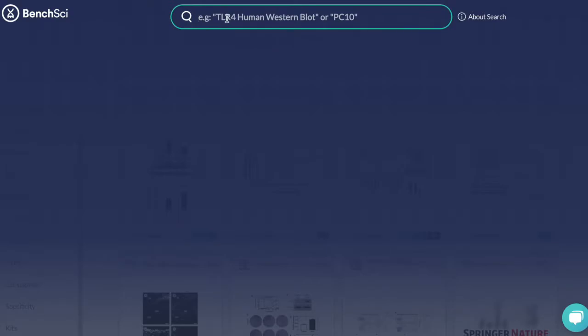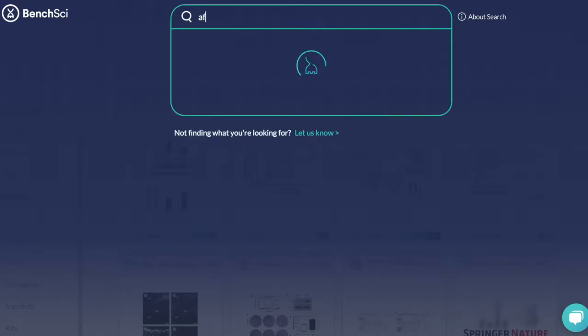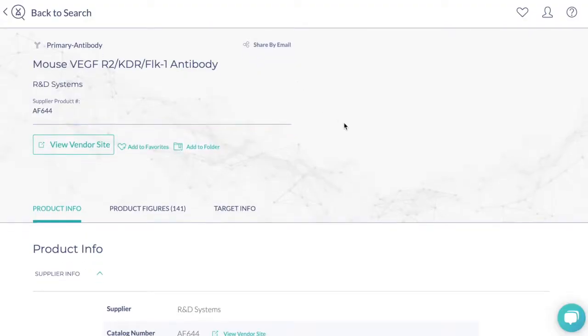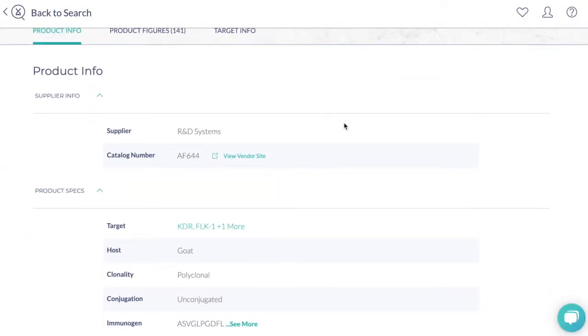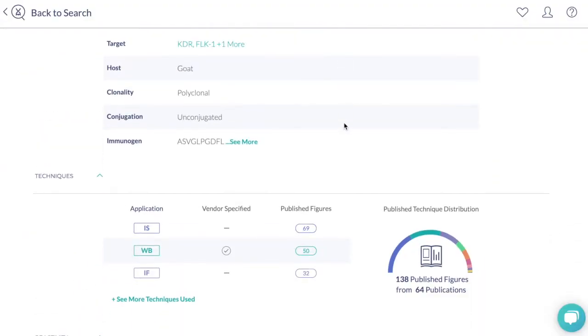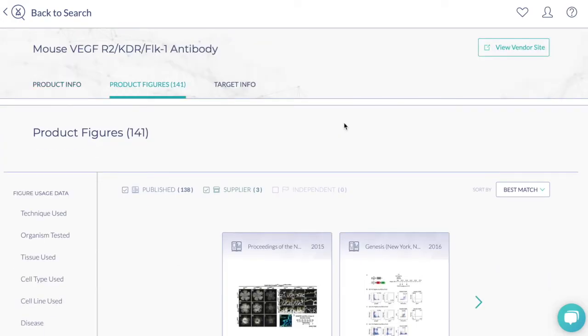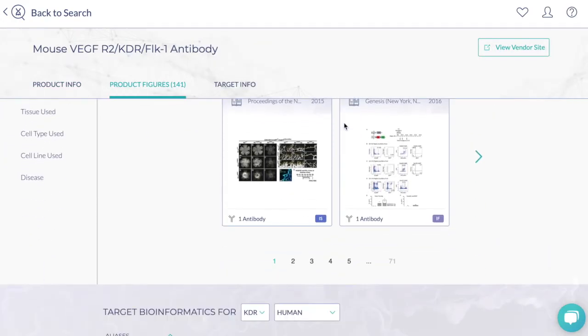To do this, simply enter the catalog number into the search bar and select your product from the drop-down menu. This will take you directly to the product page where you can review product information, figures, and bioinformatics.